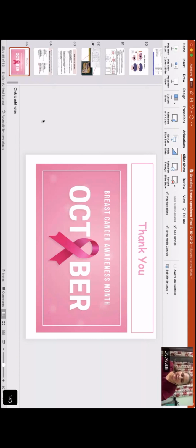No. The tumor bed size, especially in a post-chemotherapy specimen, and the tumor size might be vastly different, because it depends on the extent of response. If you have a concentric kind of tumor, the tumor size will become much smaller than the tumor bed. While if you have a buckshot type of response, then as per the RCB as I showed, the tumor can be scattered everywhere, and the total tumor bed size will be the tumor size also. But in AJCC, it is the largest contiguous focus. So there is some discrepancy between the two systems, but generally the tumor bed size and tumor size do not mean the same thing.